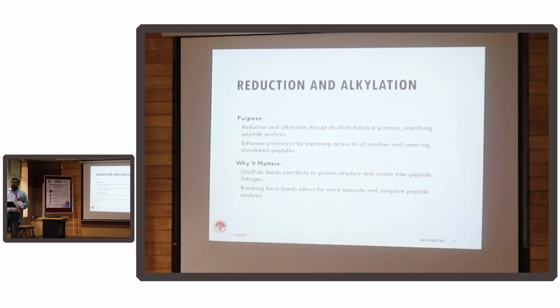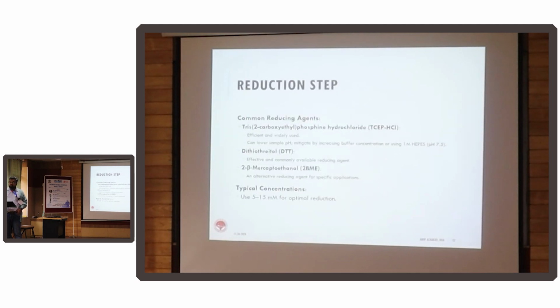persistent. So once you break them, there is a tendency of these bonds to scramble back, not at their exact positions, but maybe at some other position. Anyway, your proteins will fold, and it inhibits proteolysis. To enhance your proteolysis, you can do a step known as reduction and alkylation. The first step is reduction. One very good, most commonly used reagent is TCEP. There is also dithiothreitol or DTT. We also have beta-mercaptoethanol. The most used is TCEP, right?